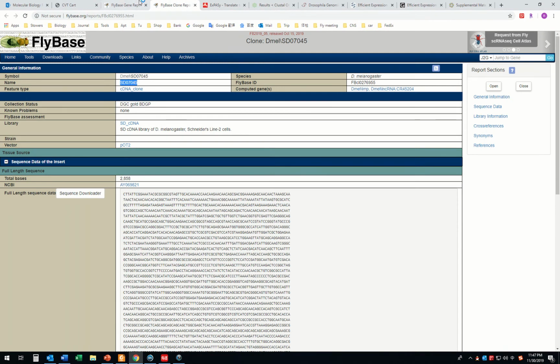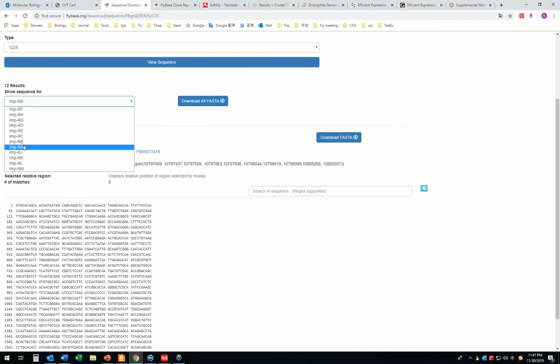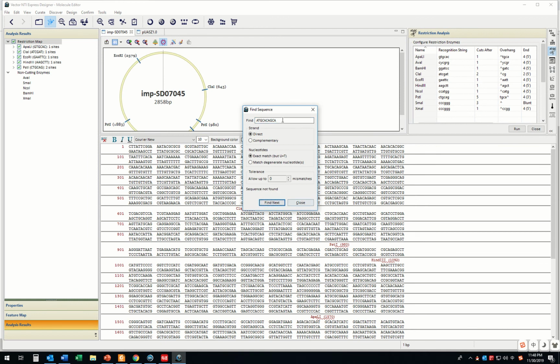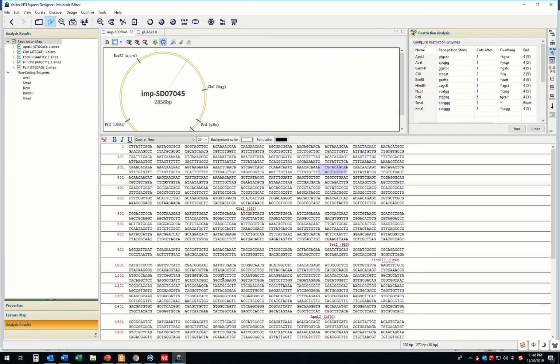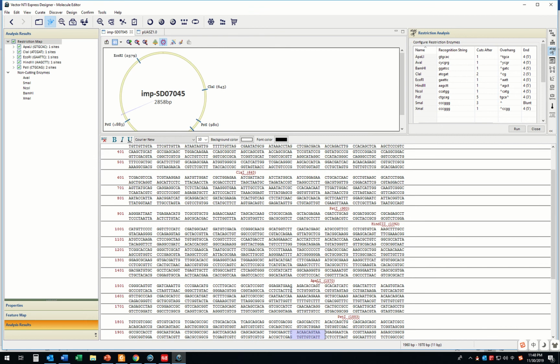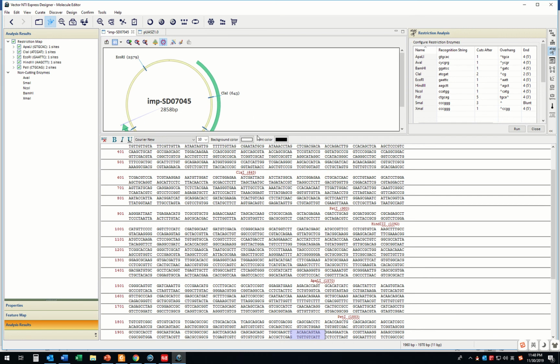Where is the ATG? I can see it starts from 270. CDS.